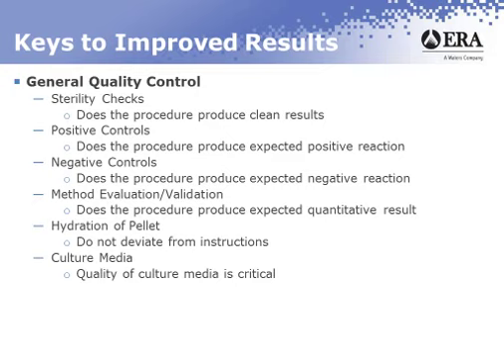If they say store it in a fridge, you need to do that. These are the source of carbon that you're going to grow your organisms from. If you do anything that starts to break down this media, you're going to have trouble. So make sure that you follow the instructions from the manufacturer, both when it comes to manufacturing it and storing it.